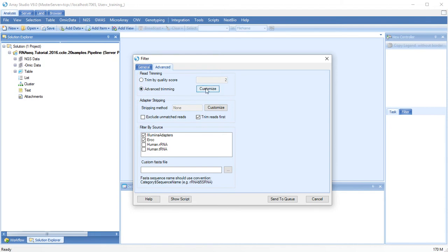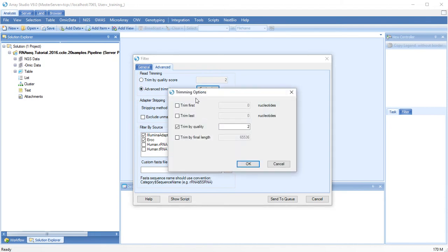Under Advanced Trimming, you have more control over the type of trimming that occurs. You can trim from the front or the back of each read by quality or trim to a final length.